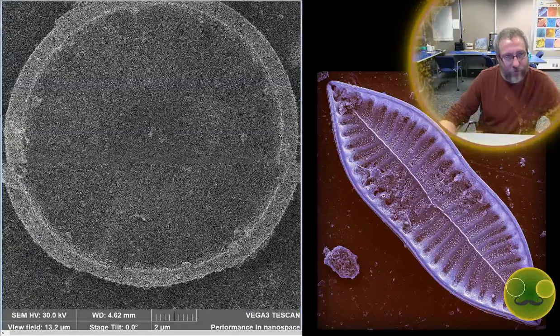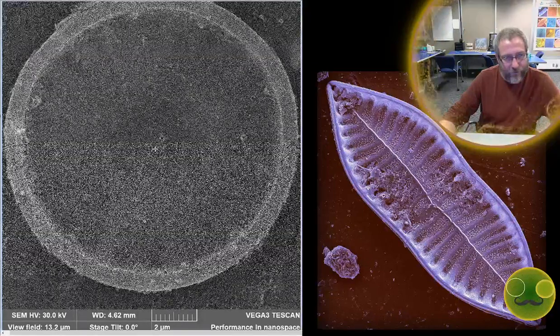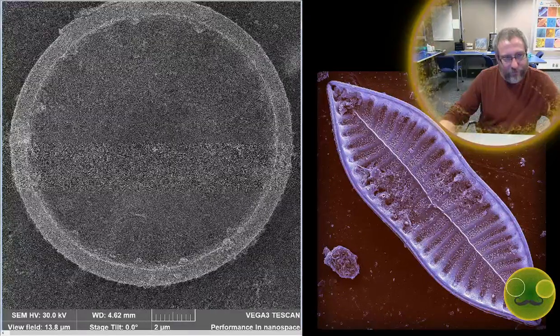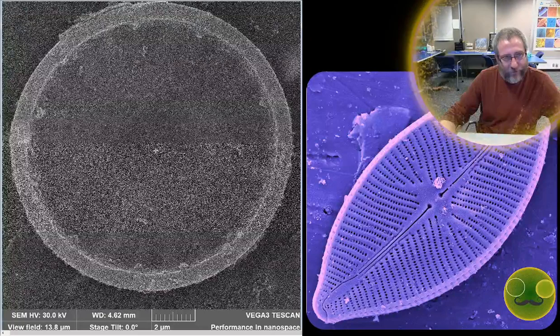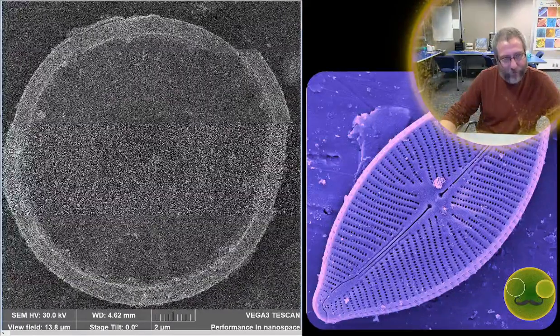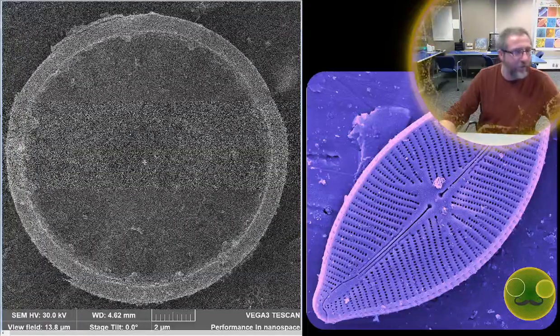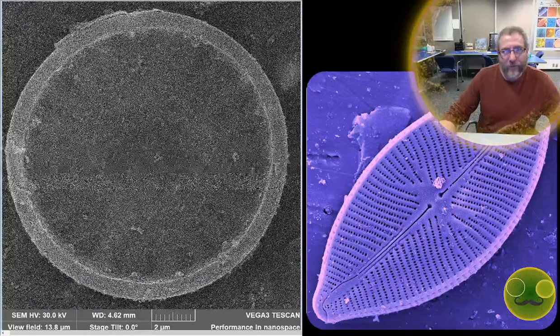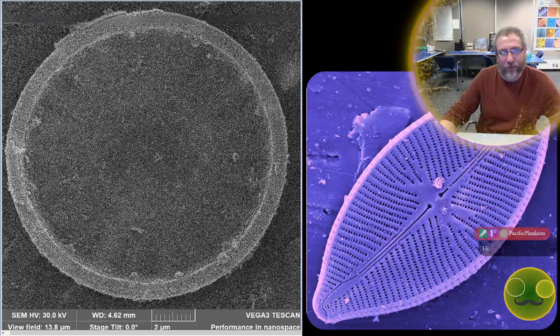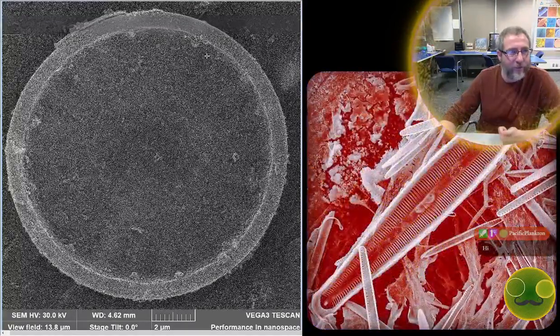So I'm just zooming out a little bit. And I'm just going to nudge it down. Give it another little nudge. So it doesn't want to come down completely from the top. Good. And then I'm going to change the speed. And I think the beam intensity is in a good place. We should be able to see a lot of the detail.